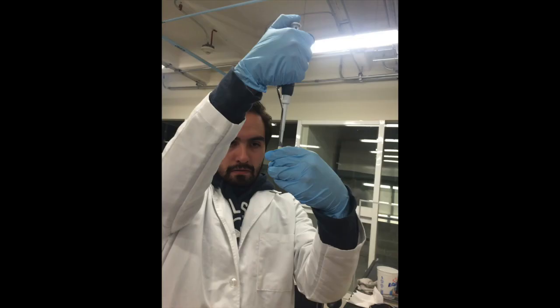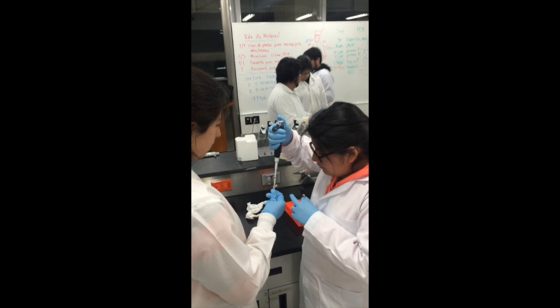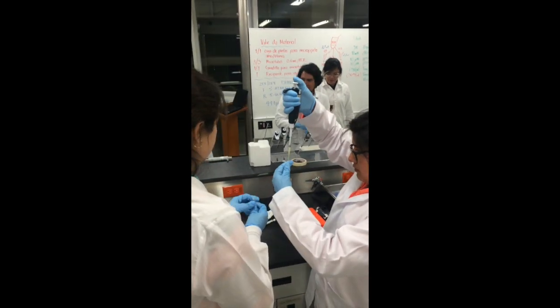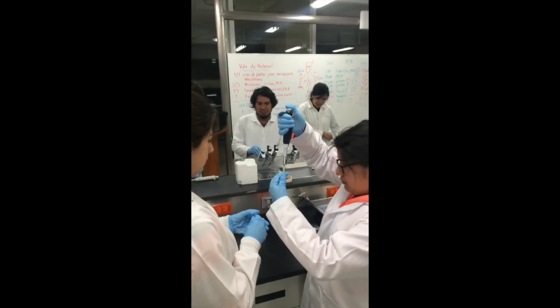In consequence, we agree that above all steps during the preparation and performance of PCR, it is critical to have excellent pipetting skills in order to avoid contamination and/or loss of samples. Also, it is important to know the working parameters of the enzyme used and the proper concentration of reagents for a PCR reaction.